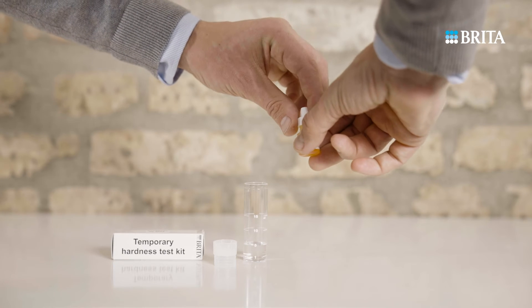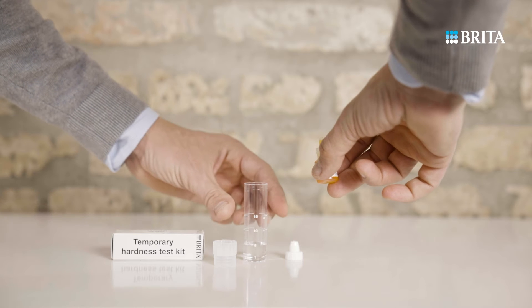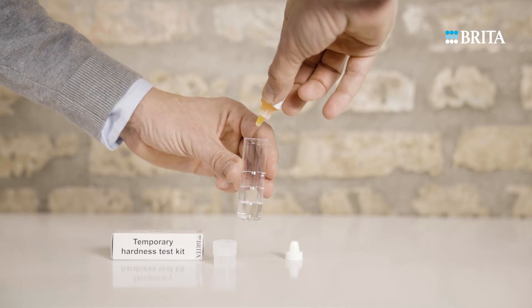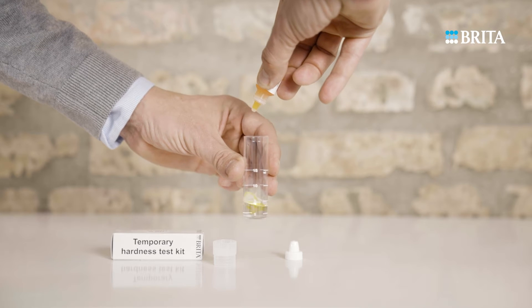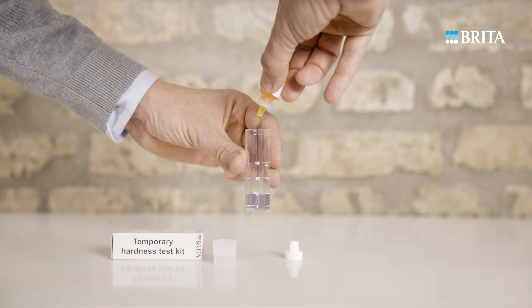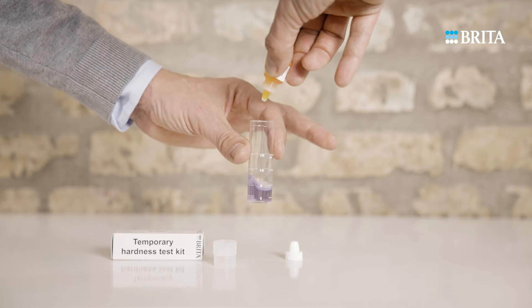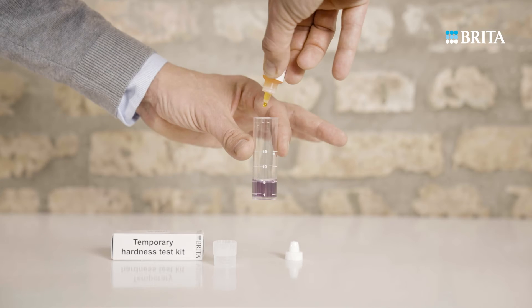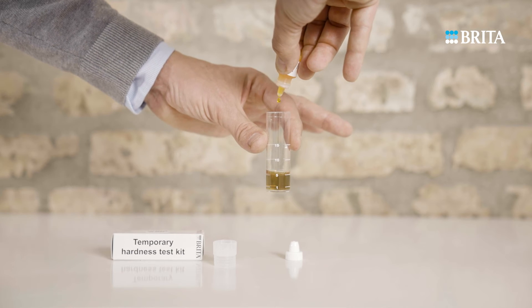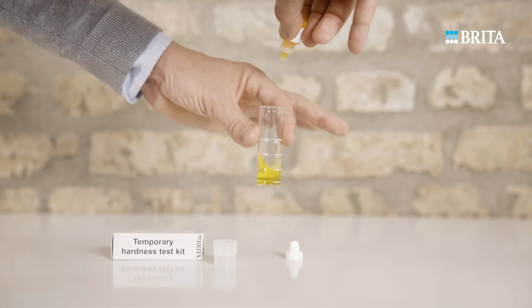To determine temporary hardness, also called carbonate hardness, use the provided dropping bottle to add test solution to the tap water. Count out the number of drops, carefully swirling the measuring tube after each one until it is completely mixed with the water. Continue adding indicator solution drop by drop until the color changes from violet to yellow. Each drop corresponds to one degree of temporary hardness.